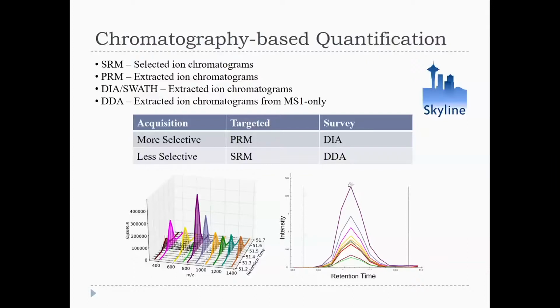So this is just a schematic. There are going to be lots of graphs in this, and I'm actually not going to talk the whole time and will ask you some questions. So try to orient yourself and understand these graphs. I know it's really hard. I always feel kind of depressed when I watch other people's presentations, because the graphs go by and I'm like, I didn't understand that graph.